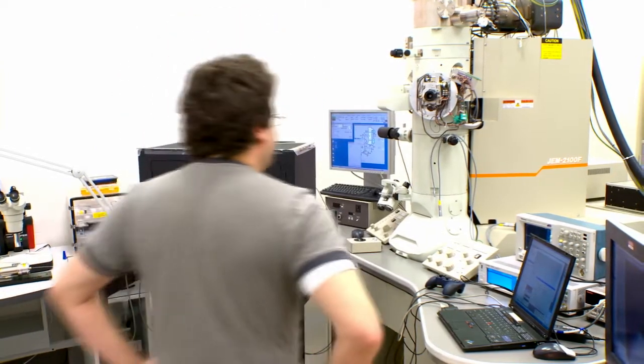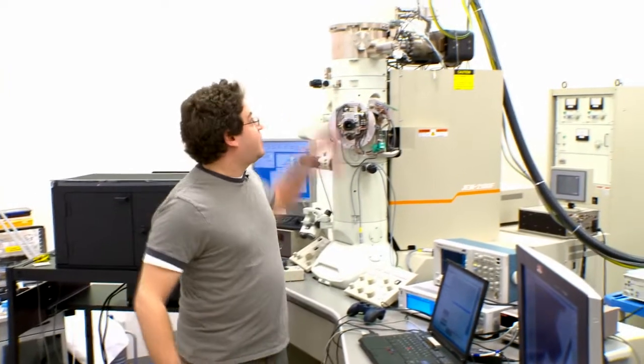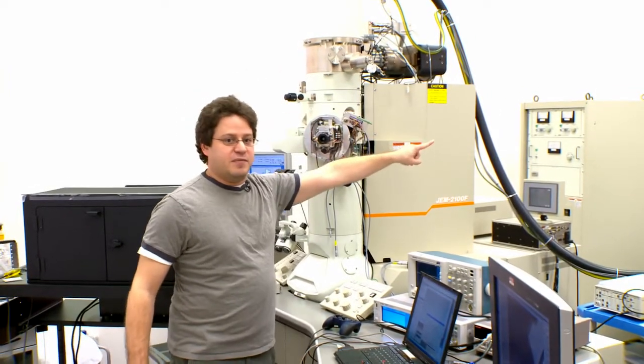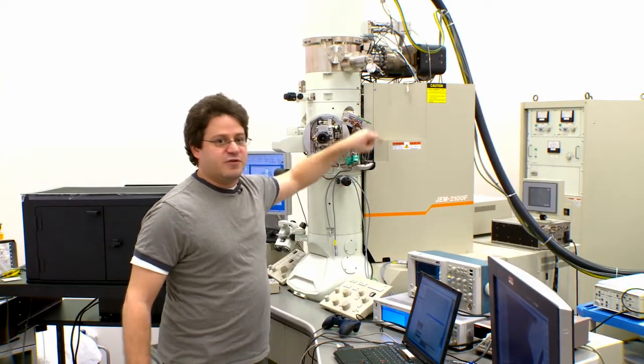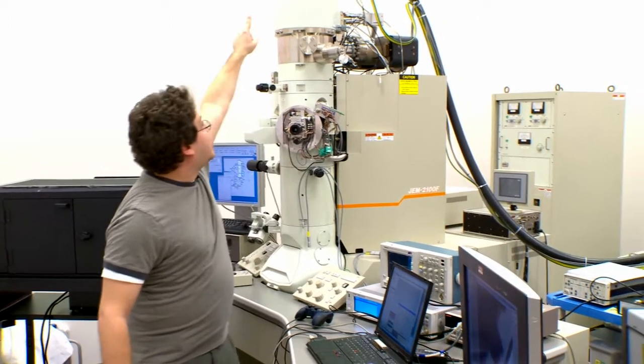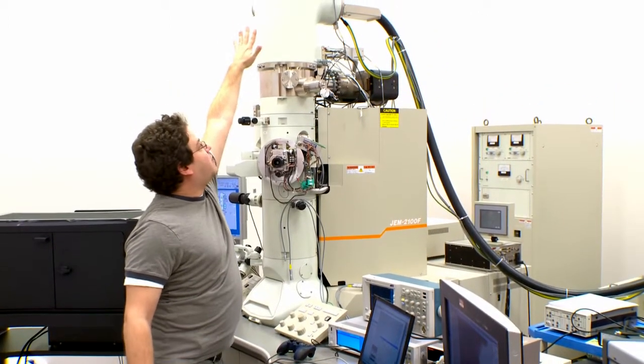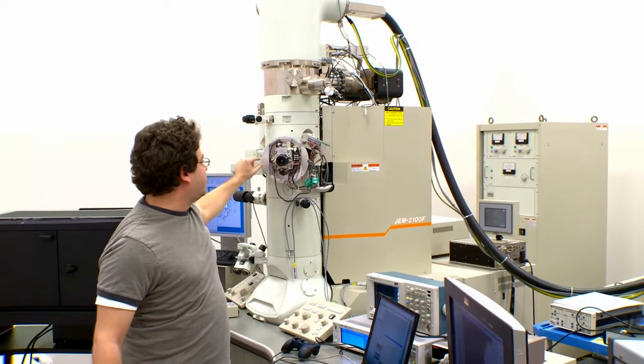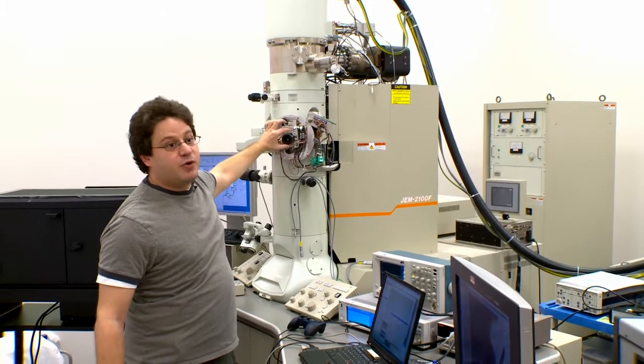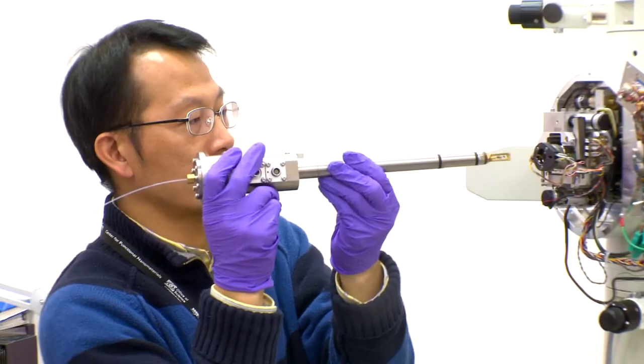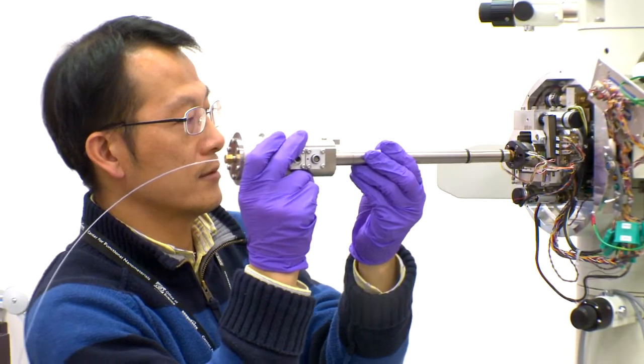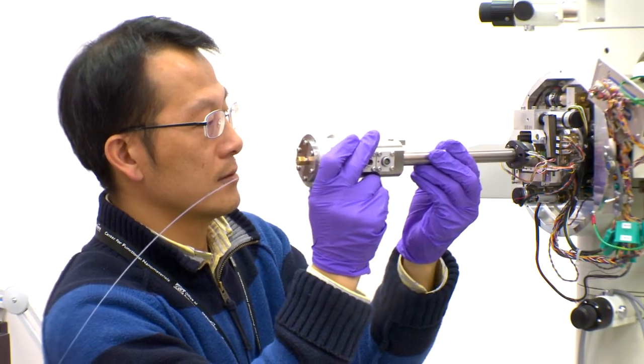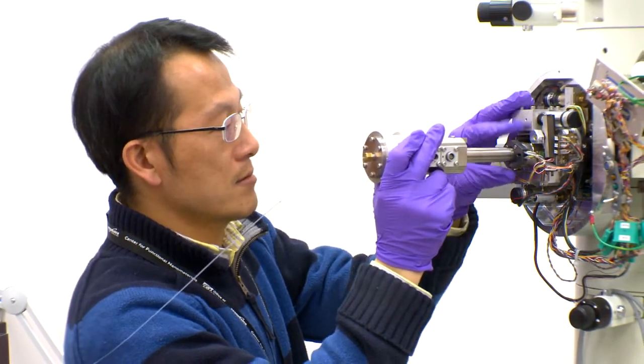Now we're going to go take a quick look at the transmission electron microscope itself. It's fairly conventional by today's standards. We have a high voltage supply coming from a voltage tank, which is off to the side right now. It generates a high energy electron beam at the top of the column and that's focused by a series of electromagnetic lenses onto a sample. We introduce the sample holder at this point here, the electron beam passes through it and we have various detectors detecting the electron beam and emitted x-rays that come off the sample.